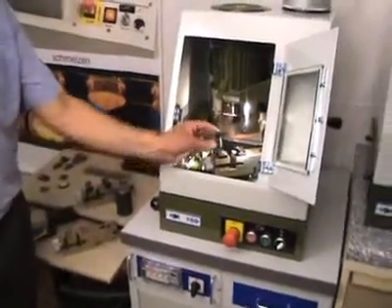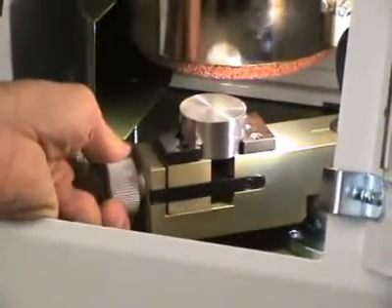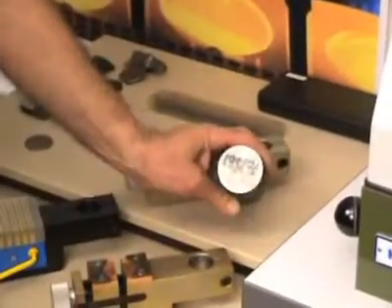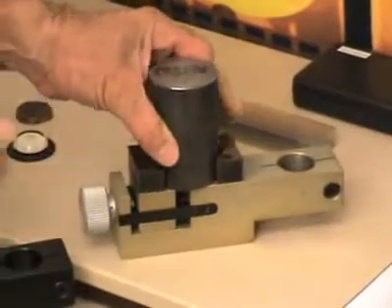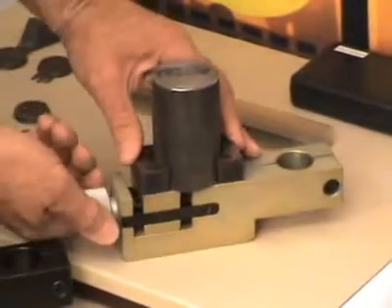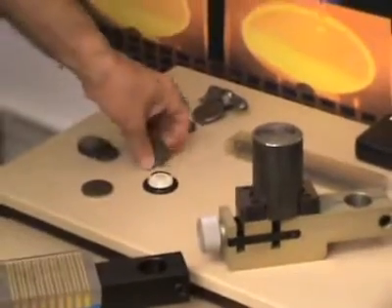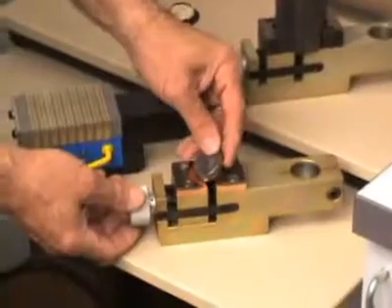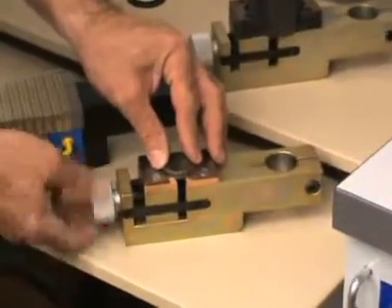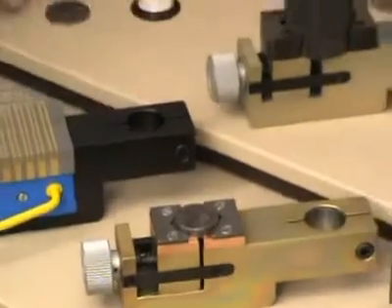The standard vise takes samples up to 45 mm diameter. Samples of bigger diameter are fixed in a big vise with special higher brackets. Small cast iron mold samples can be fixed in the standard vise with exchangeable low brackets which come as standard accessory.